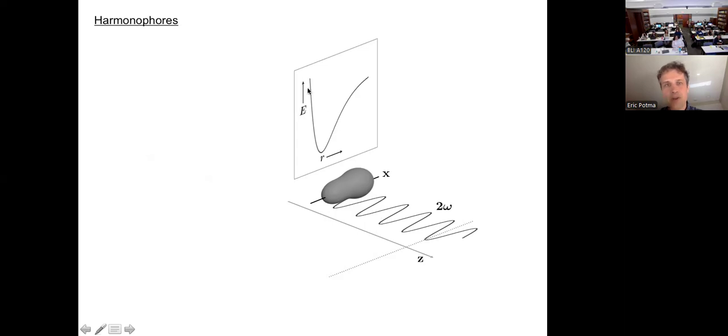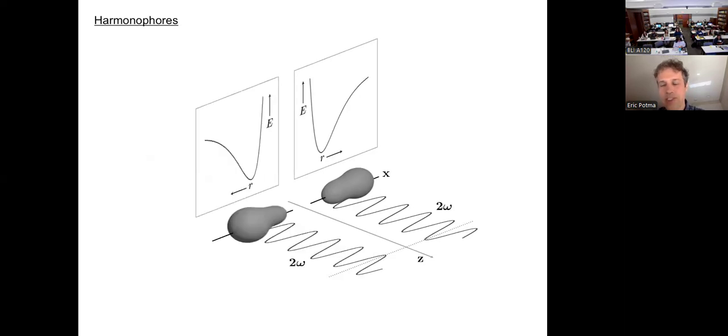So this molecule, this is the potential well again. As you can see, I've determined now I can generate second harmonic generation from this single molecule. But now I'm going to put one of its neighbors next to it, same guy, but now opposite direction. I'm going to turn it around by 180. And if you do that, I also turn around this potential. Now on this side, it's easier to pull it out and harder on that side. And therefore, this waveform also makes a 180 flip.